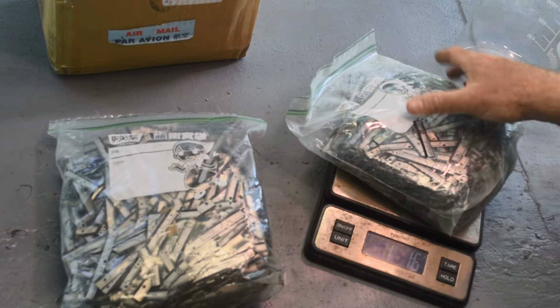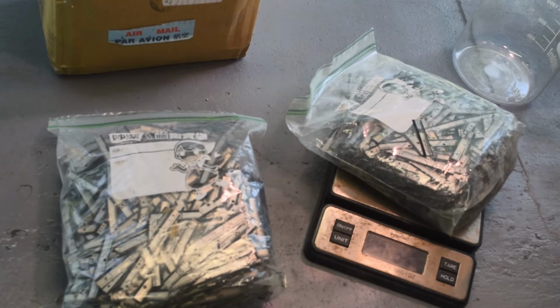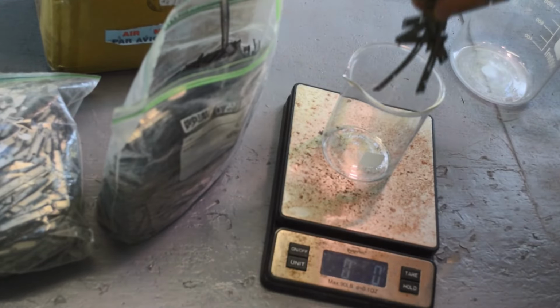First thing I think I need to do is figure out whether there actually is any palladium in this stuff. Like I said, there's a bit of a language barrier between me and Joven, but he thinks there's palladium here. He also said that he thought these had been gold plated at one time, and the gold plating has already been stripped off. Now, most things that would strip gold plating, I'm thinking, would also strip palladium. So I don't know if there's really going to be any palladium left on these or not. So first order of business is to see if we actually have any palladium here, and then work on an efficient method to remove it from these things if there is. So we do a small scale test, and we'll see what we've got. Let me get set up for that, and I'll show you what I'm going to do. All right, for my small scale test, let me see if I can get about 100 grams of this stuff.